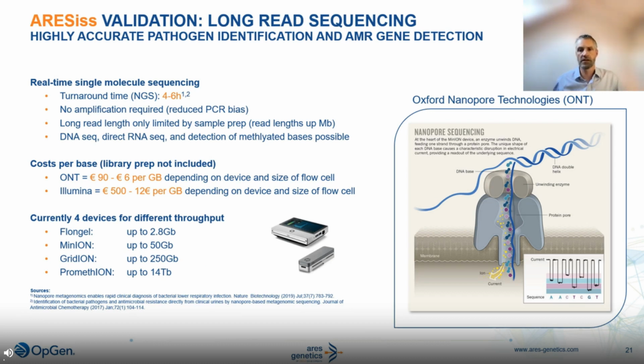Nanopore sequencing is an interesting platform for clinical microbiology for a number of reasons. The turnaround time is very low, theoretically enabling same-day reporting and workflows as short as 6 hours. The technology also generates long reads, which offer interesting advantages for the assembly of bacterial genomes and, for example, for the recovery of plasmids. Finally, the small footprint and the low capital equipment cost, as well as per base cost, make this an interesting platform for clinical or surveillance applications, also in low to mid-income countries.